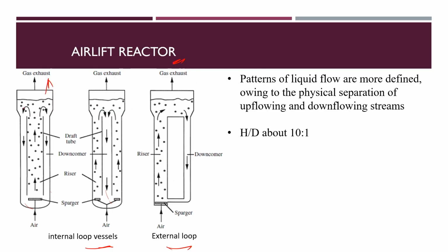So, this is the internal loop, and further there is a possibility to have the external loop where a riser tube is almost closed, you can see, and gas is going out like this, then it has to circulate along with the space available due to the riser tube. So, it is going like this, then it is getting circulated. So, you can say this is a kind of external loop because of the position of the riser.